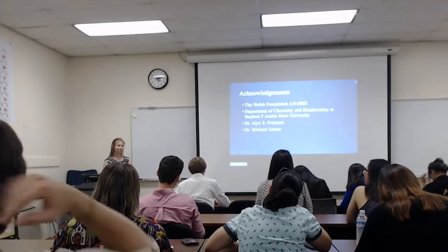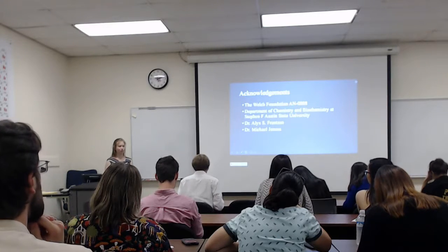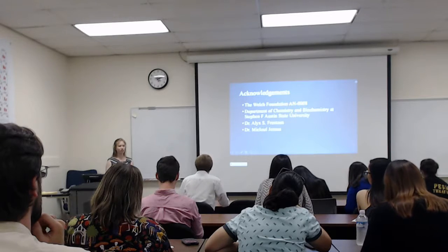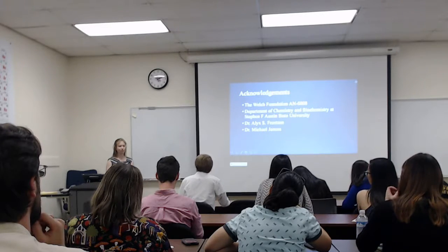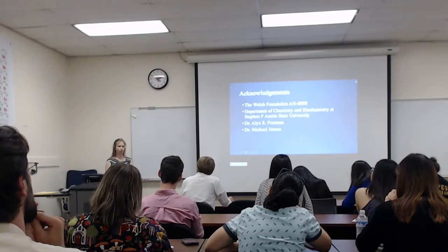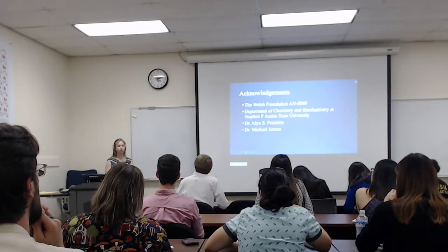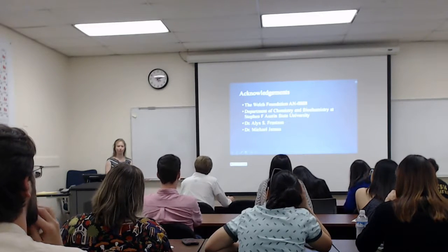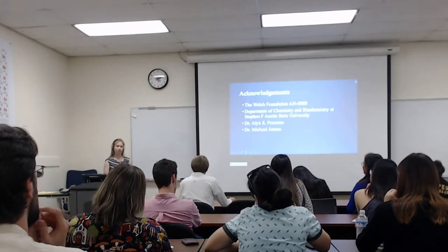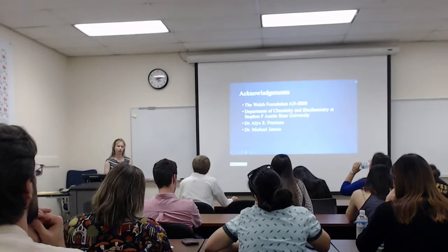The reason for your research is to find a better method to find CEC within 20%. Do you know how the standards were measured and how correct they were? The standards were mostly measured by the ammonia gas selective electrode, I do believe, and so they were within the 20% error. However, they have been repeatedly studied since the 70s or 80s, and we actually have very accurate knowledge of what they are.